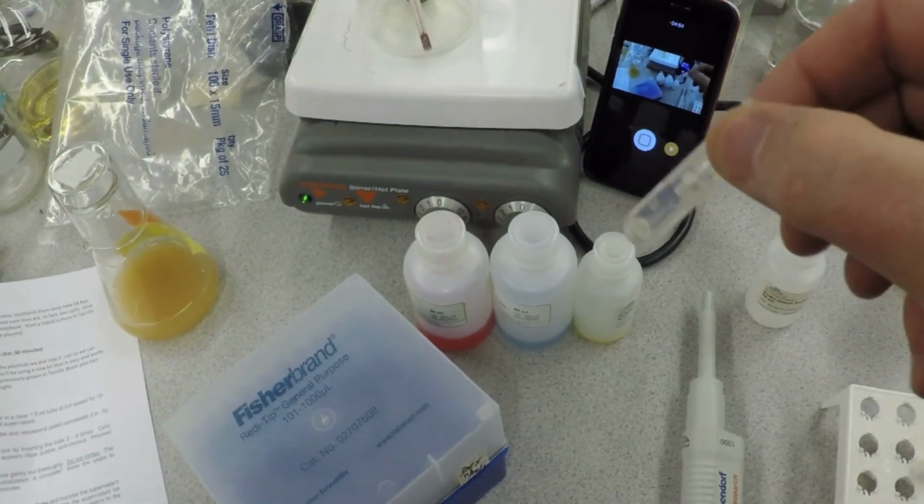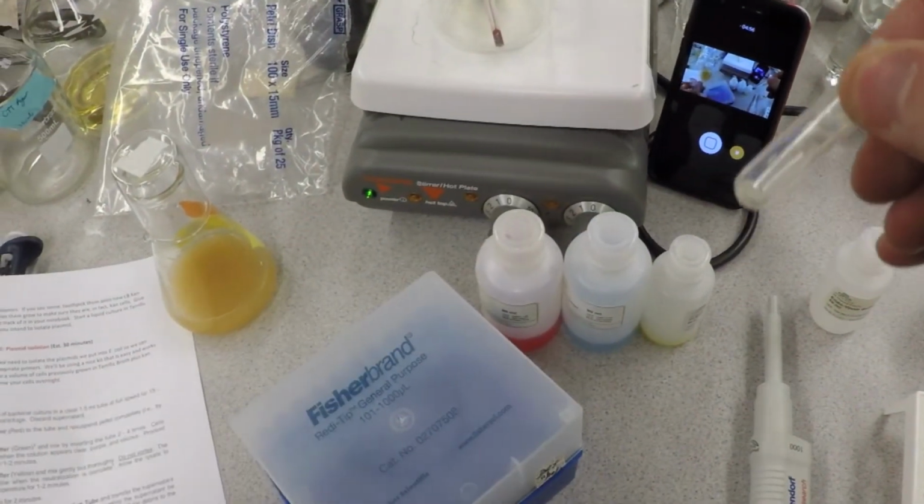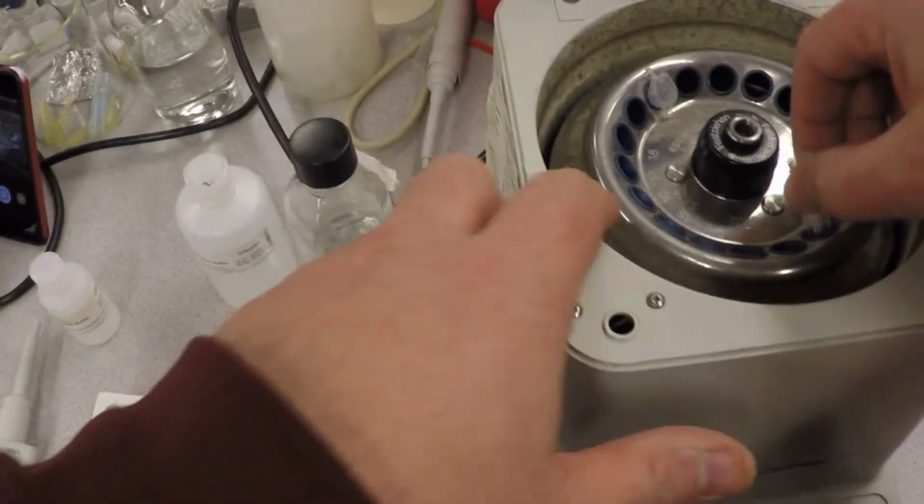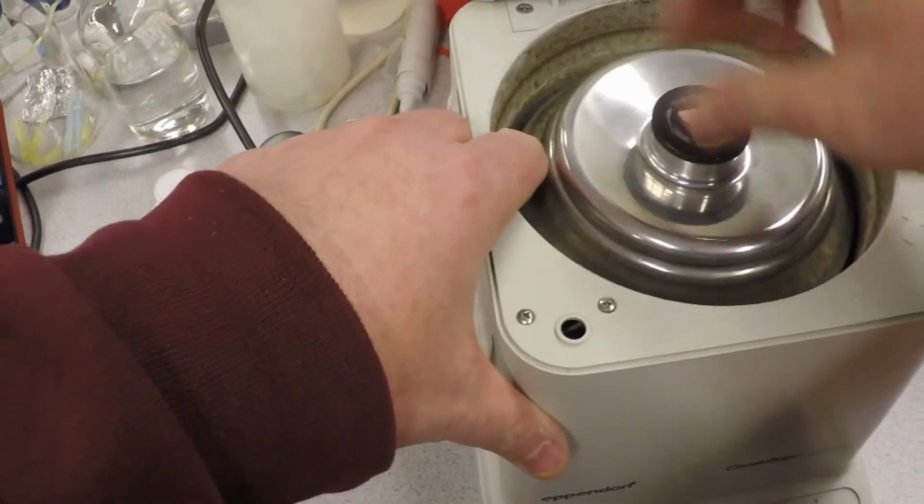Now we're going to spin this, and then it'll be pulling that endo wash through that white thing, and you're washing our plasmid essentially. So we do the same old thing. Stick it in, 30 seconds, let it go.